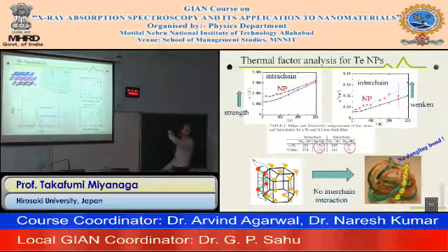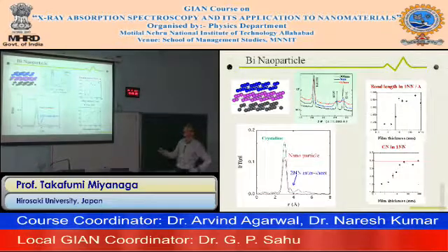The second topic is the bismuth nanoparticles. As I showed you, the two-dimensional sheets are stacked three-dimensionally, and this is the result from the XRD, for the crystalline state and nanoparticles.